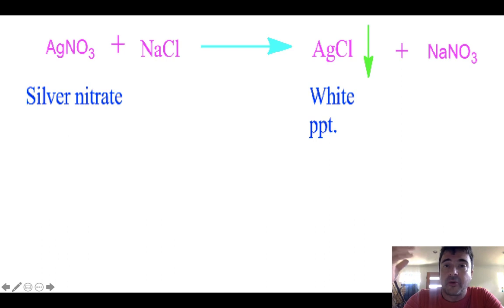or not. Presumably, sodium chloride, if it is permeable, is going to diffuse from areas of high concentration to areas of low concentration. So if that membrane is permeable, we're probably going to find sodium chloride in the solution. It was distilled water, but did any sodium chloride get into that distilled water through the dialysis tubing? That's the question we're really asking. So we use silver nitrate as an indicator. We're using silver nitrate to test for the presence of sodium chloride in what was distilled water.